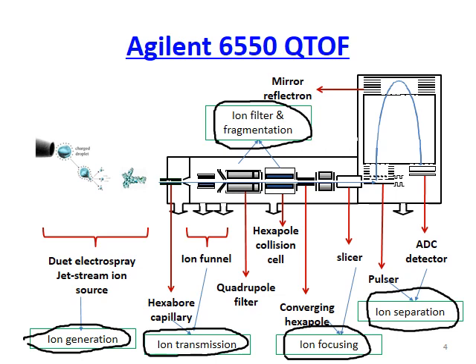For ion generation, they use the dual electrospray Jet Stream ion source. What the ion source is doing is to generate ions.